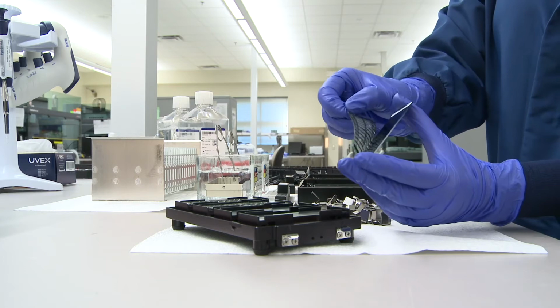The chip is the key to unlocking your genetic code because it holds a key ingredient, synthetic strings of DNA called probes. These DNA strips are made of A's, G's, C's, and T's, the same letters your genes are made of. These DNA strips help us locate the parts of your DNA that are just next to the letters we want to read, called variants.